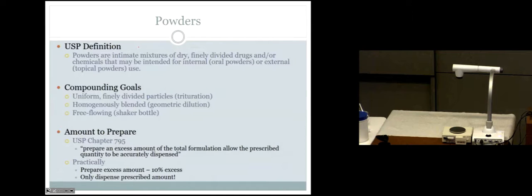Well, what is your next dosage form? A capsule. What's inside the capsule? A powder for internal use. So you're just encapsulating it. So powders are obviously used for both internal and external, and that's why it's very important to make sure whatever your product is labeled such that we know that it's intended for external use. Okay? All right, enough said with that.